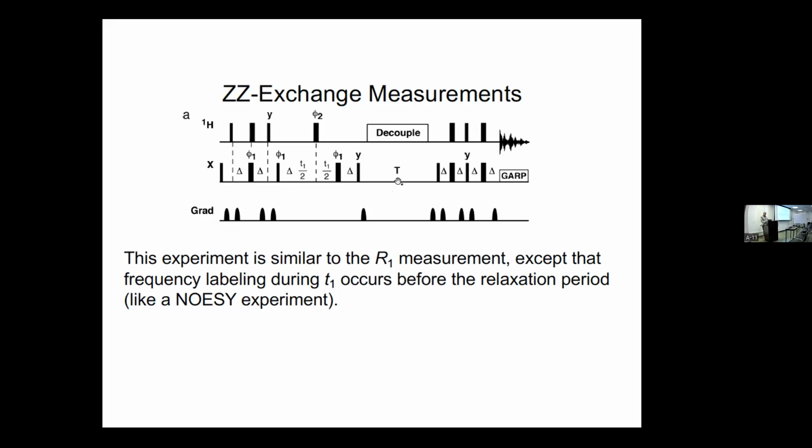Then you would have to have basically a way of, for example, having a total period T in which part of the time for which T1 happened the whole time, and part of it you were able to turn off exchange. So you would have a variable delay where exchange evolved, and then T1 would happen the whole time. So T1 wouldn't depend on, yeah.